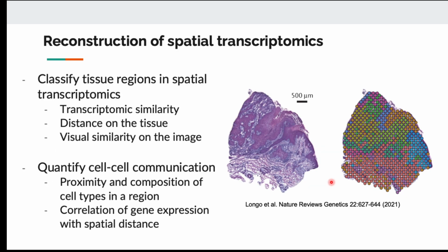When we think about spatial transcriptomics, we have two types of information. First is the image. You see the change in tissue structure, like the change in cell type from the image. But you also have the transcriptome data that tells you about the change in gene expression program. So in spatial transcriptomics, you can analyze it in terms of purely omics data, but you can also combine it with the imaging data to tell that we have transcriptomic similarity among cells in this region, like they are all yellow, meaning that they have the same transcriptome profile.